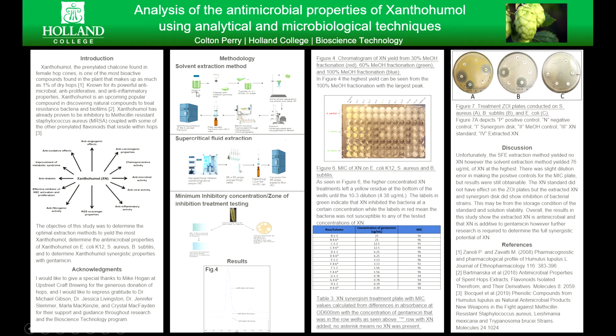I first placed all my hops in 100% ethyl acetate, filtered, transferred to the 3:1 ethyl acetate and water, and allowed the liquid-liquid partitioning to take place, extracting the top phase off, and then roto-evaporating the ethyl acetate off the top phase, and resuspending in 100% methanol, running through mid-pressure chromatography, fractionating, pooling together my samples, filtering of course, and then identifying the samples for any xanthohumol on UPLC.